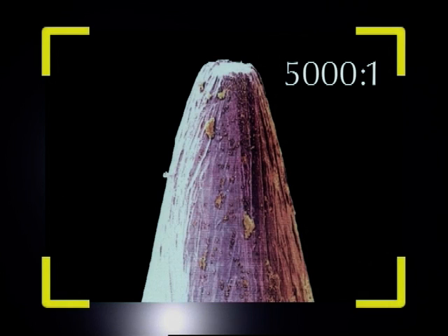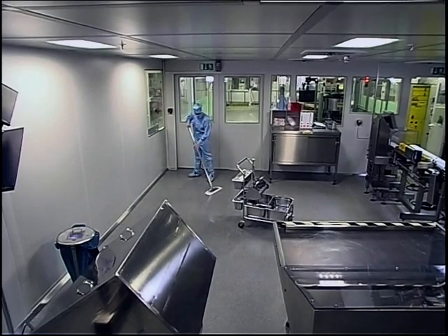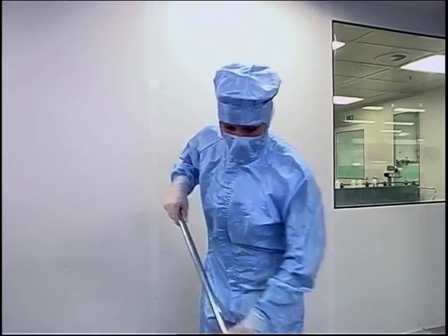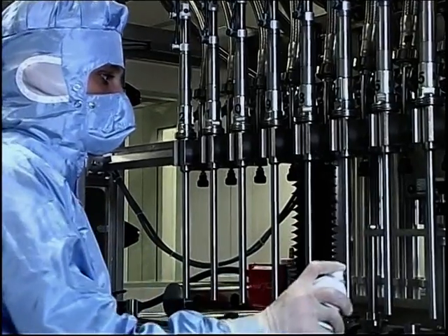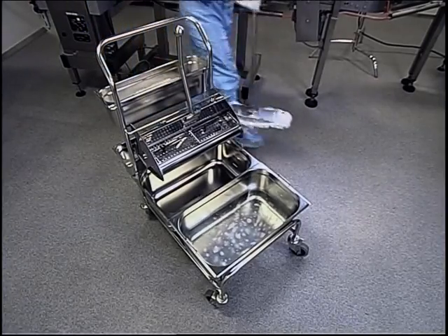This is why a very specific procedure for cleaning and disinfection, which follows extremely precise regulations, has been developed. This gives us the certainty that we are able to eliminate the invisible contamination sufficiently. And that's not as easy as you may think. It has been proved that only very special cleaning agents and equipment with clearly defined instructions for use actually meet these demands. So, whoever takes on the responsibility of this work must be taught and trained accordingly.